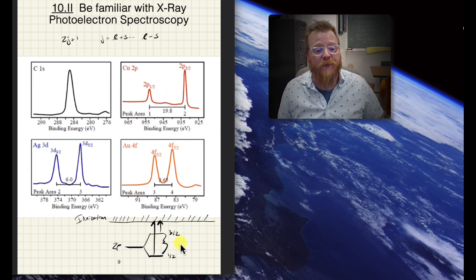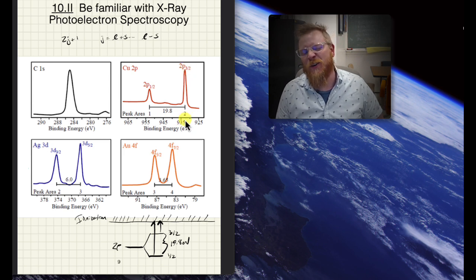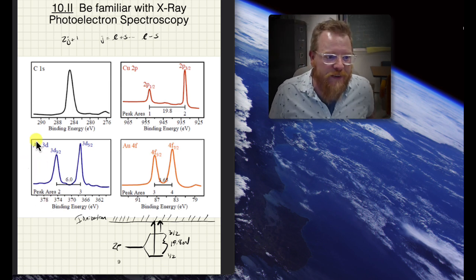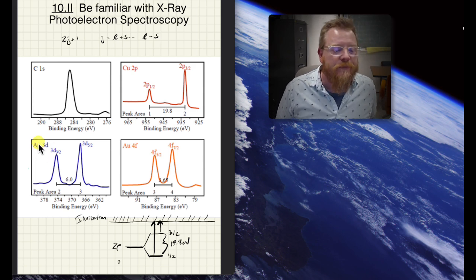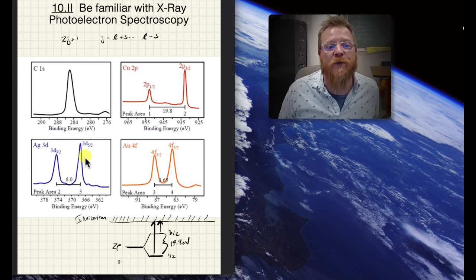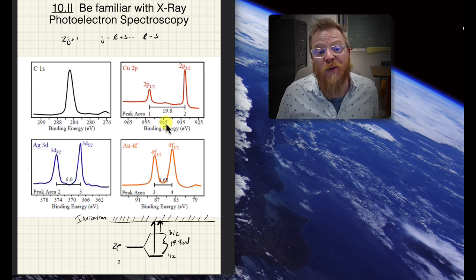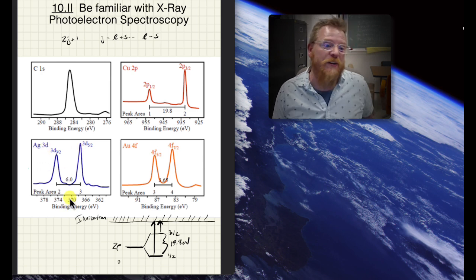In the case of copper, the difference between those two is about 19.8 electron volt, which you can see separated in this spectra. There you can see 2p 1/2, which corresponds to the low J value, with around 954 or so binding energy, whereas the high J value, the 2p 3/2, is more like around 934. If we look at silver 3d, we can see the binding energy is different. It's not only a different orbital, but a different atom. But more or less the trend is preserved, where you can see 2p is much closer to the nucleus than 3d. This copper 2p is showing up around 950 or so electron volt, but the silver 3d only shows up around 370 or so electron volt.